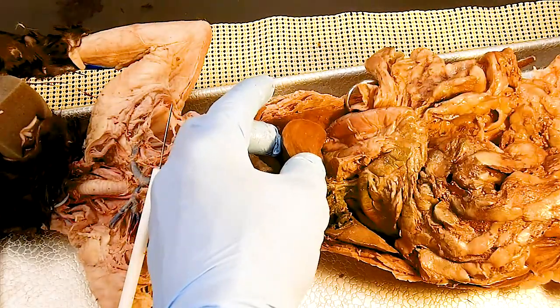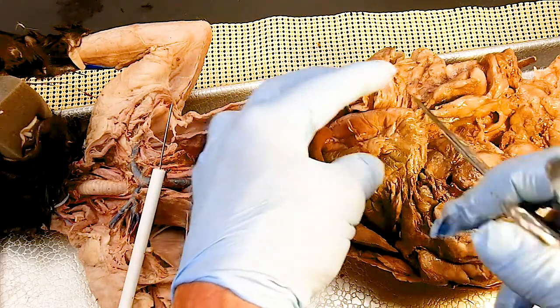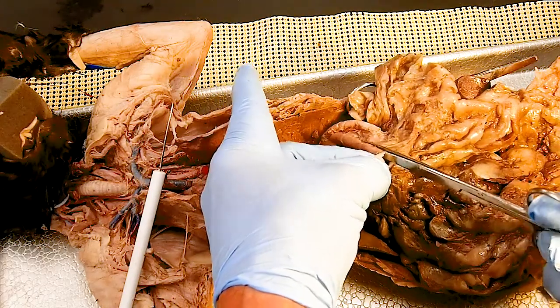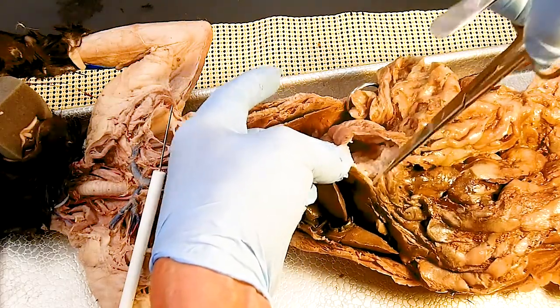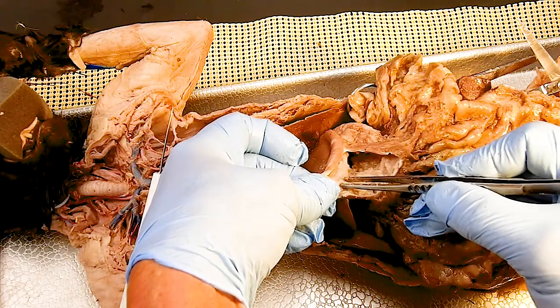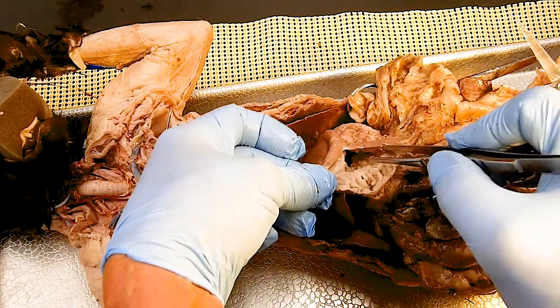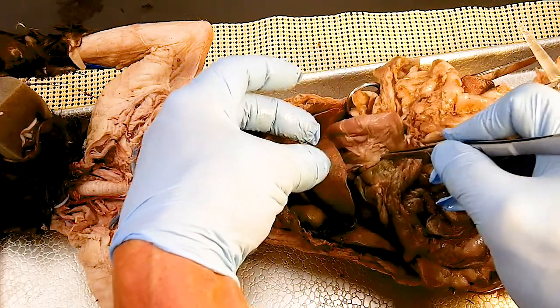That's a gallbladder. Now inside the stomach, if I cut it open, get a pair of scissors here, might be able to see some rugae, particularly at the pyloric region of the stomach. Again, a little bit of contents in there, but these kind of wrinkly looking folds, you can see them a bit here at the pyloric region. Those are the rugae, accordion-like folds that allow the stomach to expand quite a bit when you fill it with food, so it'll distend a bit.